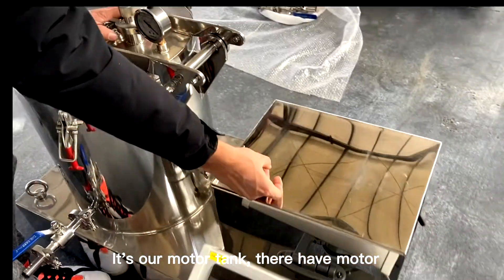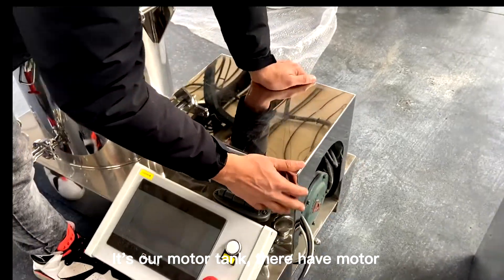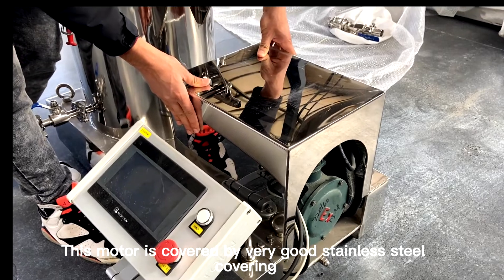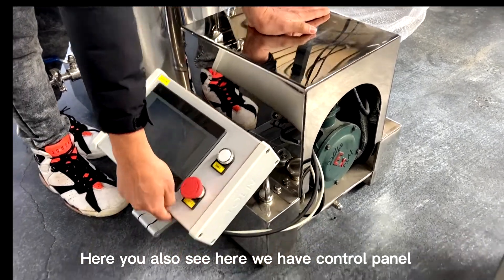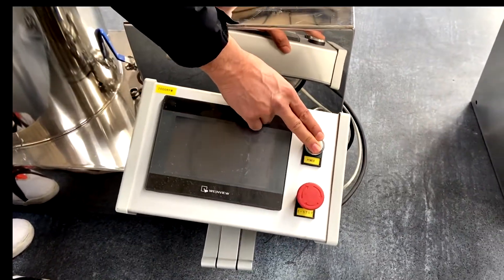Inside the motor tank we have the motor. The motor is covered by a very good stainless steel covering. You can also see here we have the control panel, where we can power on and power off the machine.